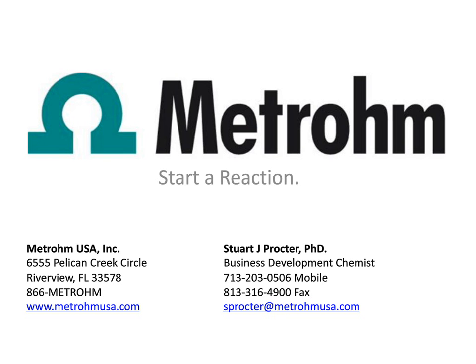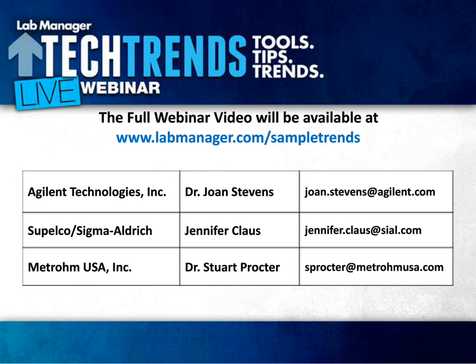Yes, exactly. I'll just pick a couple of the techniques that I talked about. Liquid-liquid extraction used huge amounts of solvents, and some of them extremely dangerous to be using in the amounts that they were doing, and also the cost of getting rid of it. And now you see people doing SLE, so that minimizes the solvent usage. And you also see QuEChERS. The initial Luke method or modifications of it used huge amounts of solvents, and so QuEChERS was also a decrease.